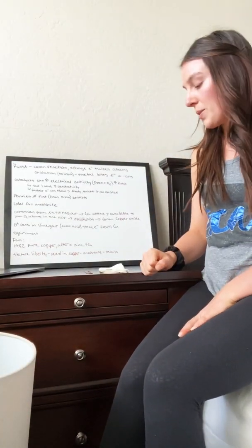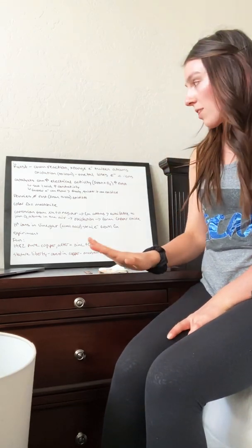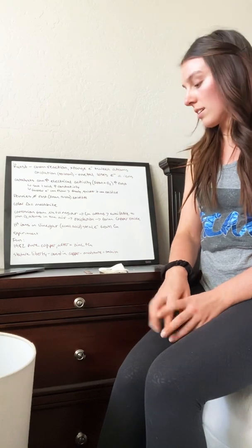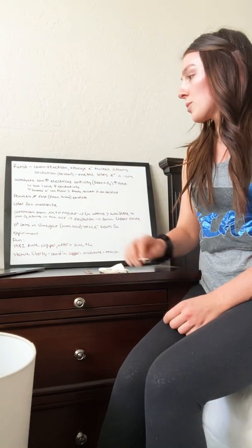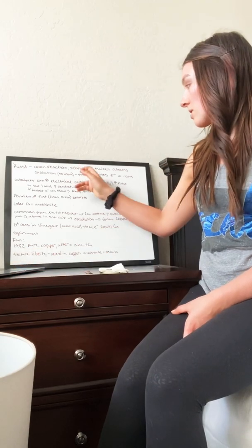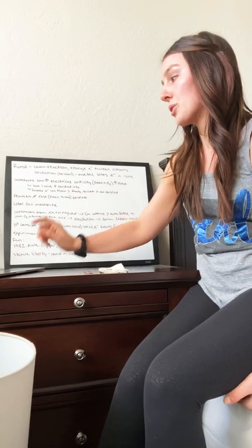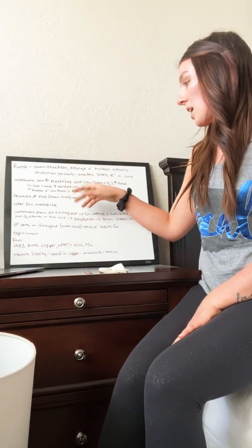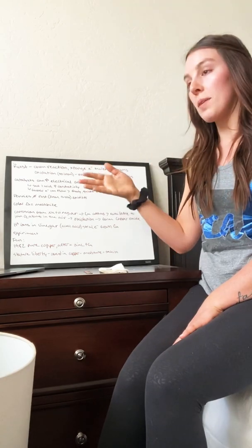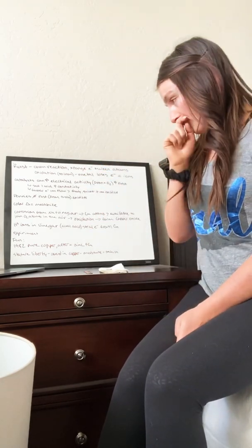Right, today we're going to be doing an experiment involving pennies and oxidation reactions with them, or rusting, is what it would look like to the common eye. So rust is a chemical reaction involving the exchange of electrons, and rust is actually used to describe when oxidation happens to iron, not to copper, but to the common eye it would appear that it is rust, common knowledge.